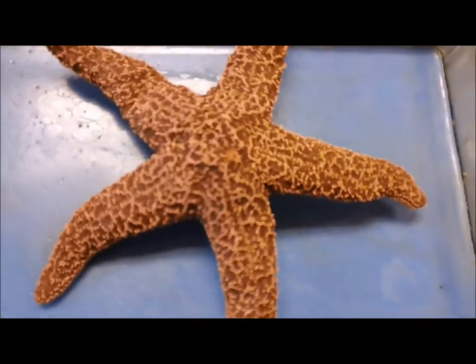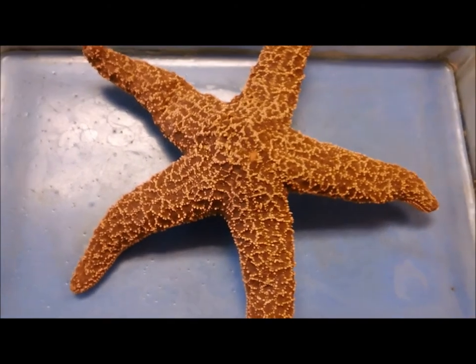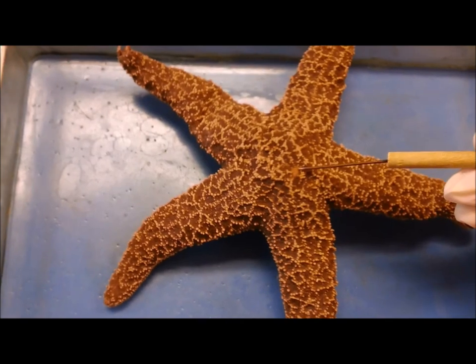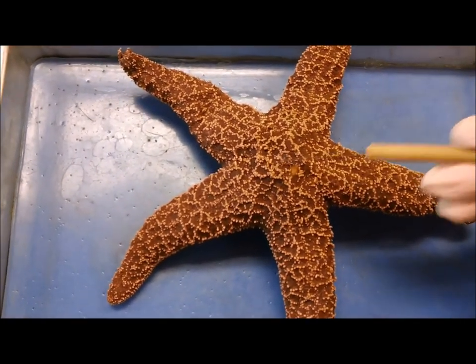Here we have the starfish. External anatomy — this is the ab-oral side. Here you can see the madreporite, the sieve plate, which means the opening would be in this area right here.